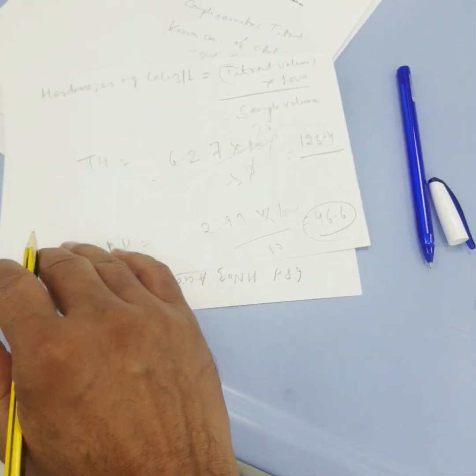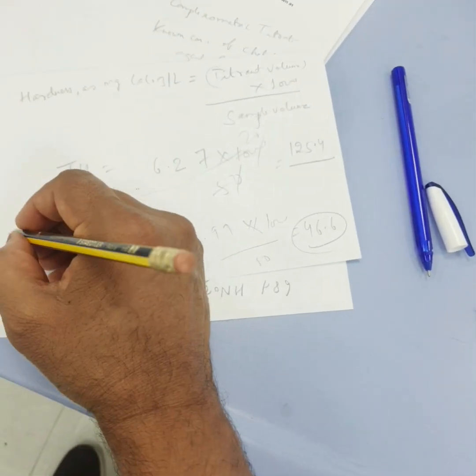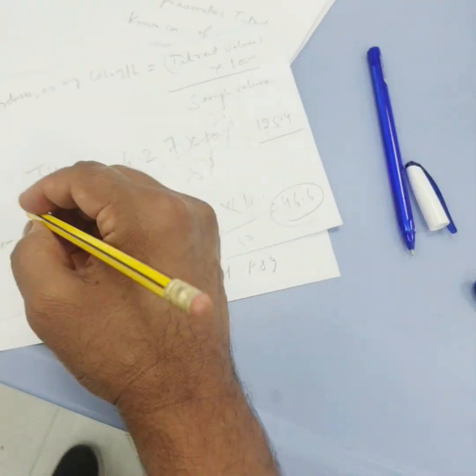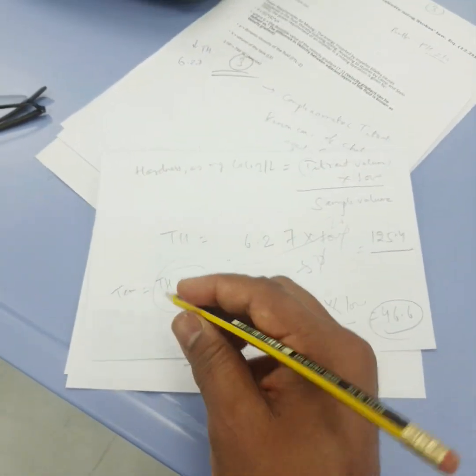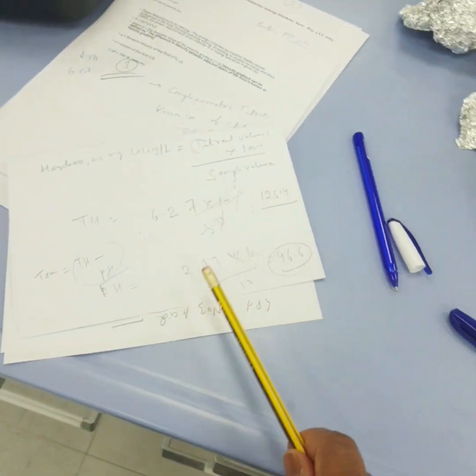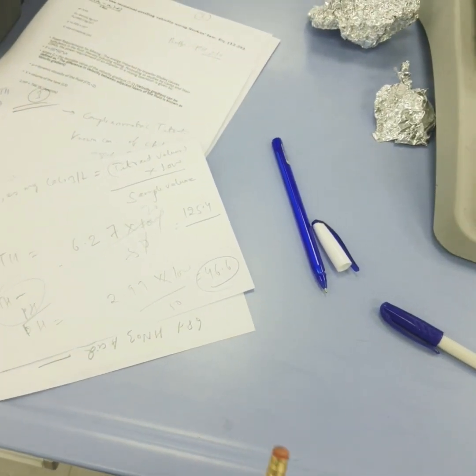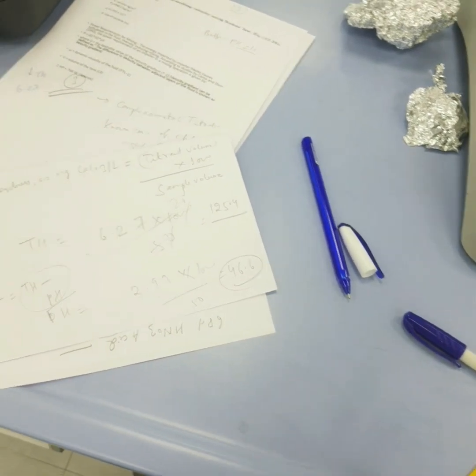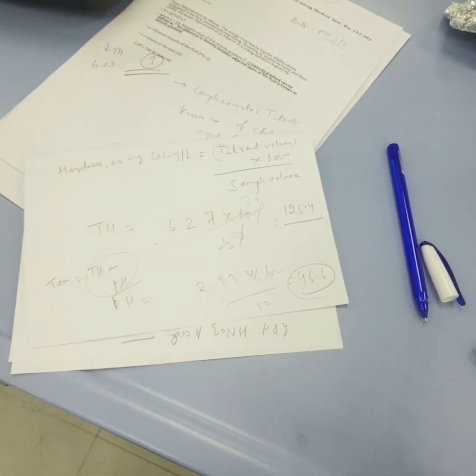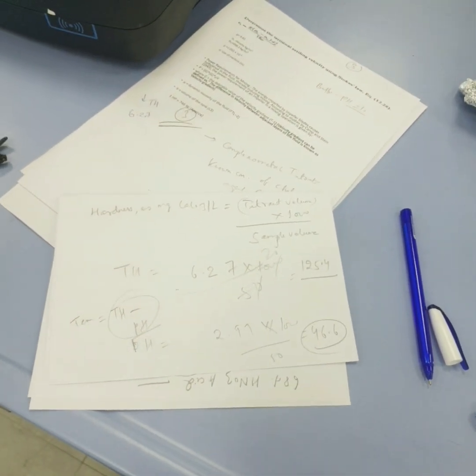So if you find out the temporary hardness, it is equal to the total hardness minus the permanent hardness. So this was all about the hardness of the water experiment that is done by titration in the lab. In the next consecutive videos we'll talk about the determination of hardness using kits or using any kind of reagent.